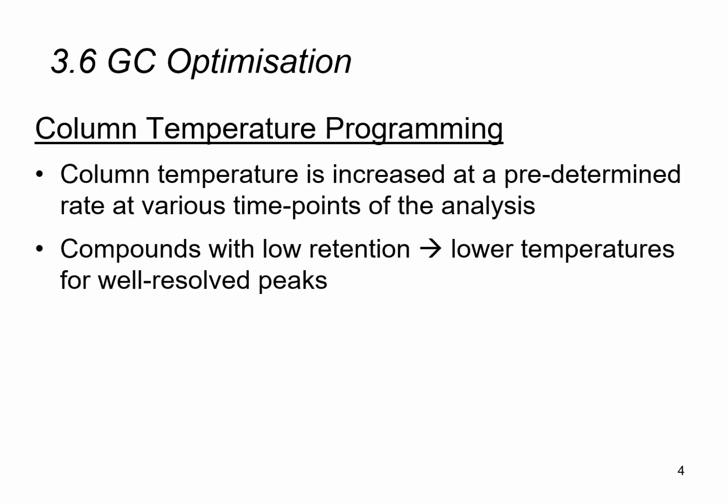So I want to talk about this idea of column temperature programming. Earlier we talked about how both having a low temperature and a high temperature have its own issues. So a low temperature will lead to a very long analysis time, while a high temperature will lead to insufficient interaction of the chemical components with the stationary phase, and is likely to lead to insufficient separation.